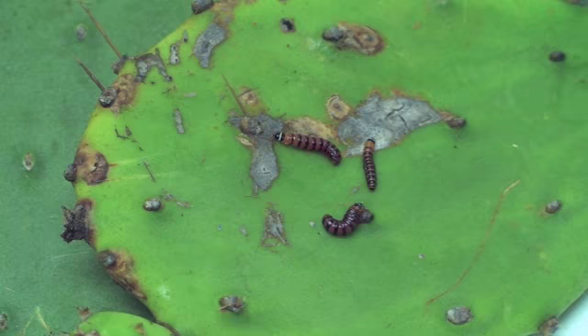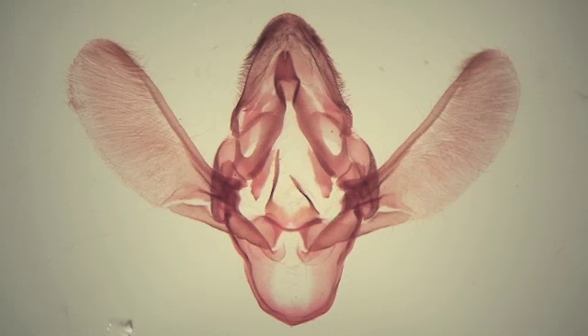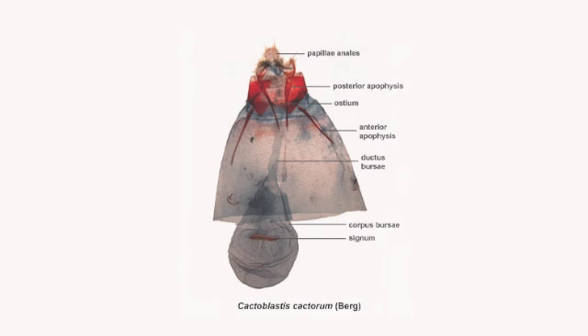In a previous video, we demonstrated the dissection and slide mounting of the male genitalia for making identifications of the cactus moth. Here, we demonstrate the dissection of the female, which has some modifications in the method from that used for the male.